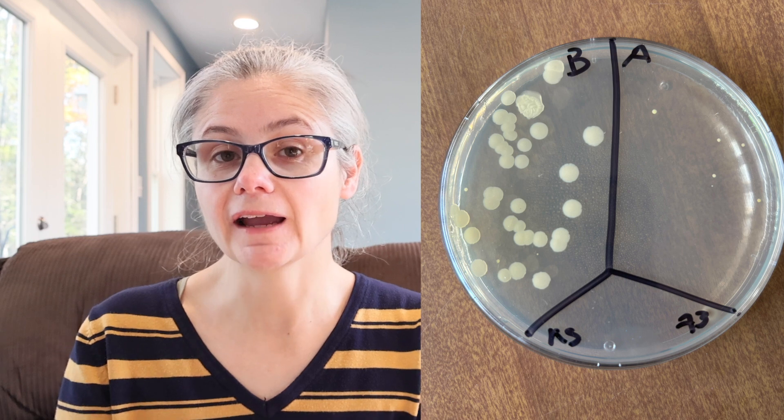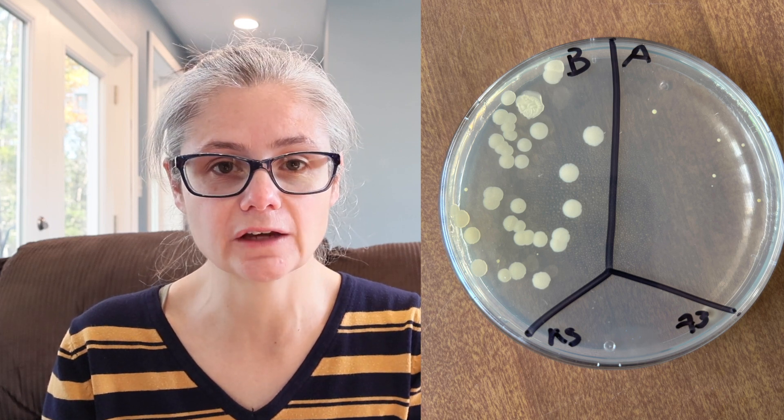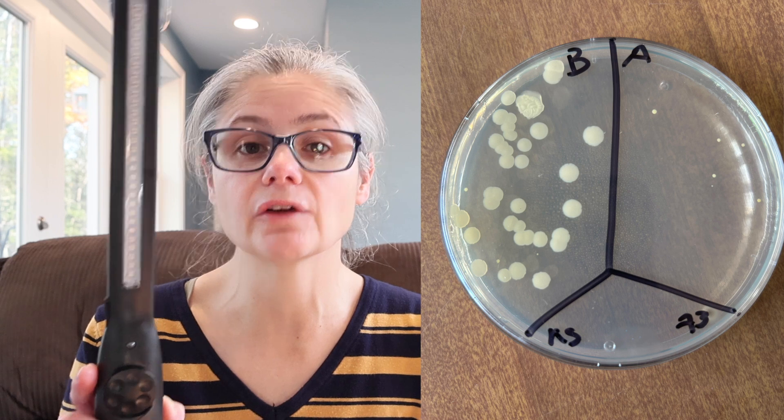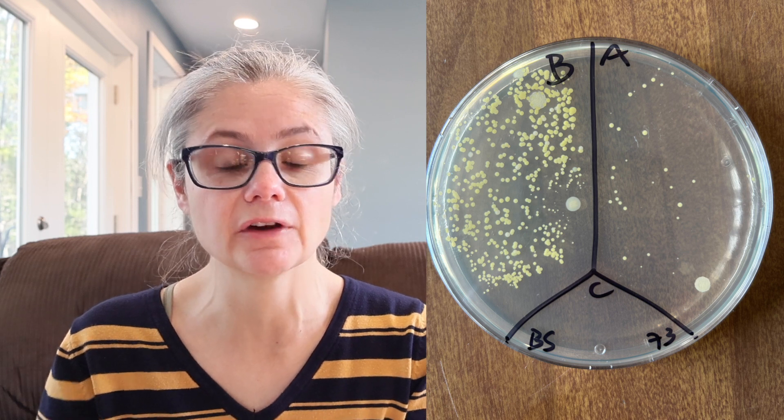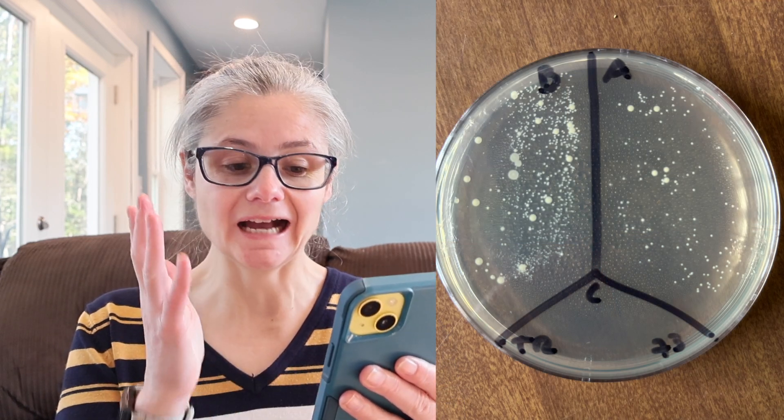Moving on to the kitchen sink: in the before section we can see some bacteria, and in the after section there is a very strong visible decrease — I'm only seeing four tiny bacterial colonies. So the UV wand did appear to remove bacteria from my kitchen sink. The bathroom sink: in the before section we can see a lot of bacteria, and in the after section there is a visible decrease, so the UV wand appears able to remove some bacteria there. The toilet rim: in the before section we see a lot of bacteria, and in the after section I'm not seeing much of a decrease — it looks pretty similar. The UV light did not do a good job removing bacteria from the toilet rim.